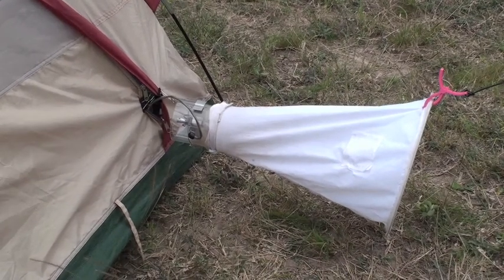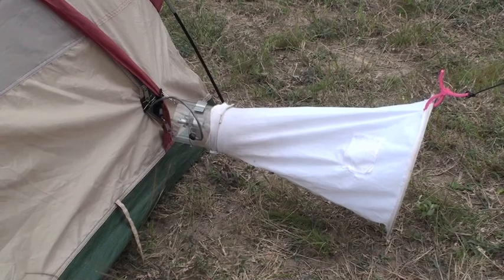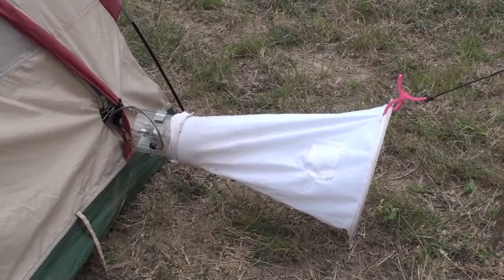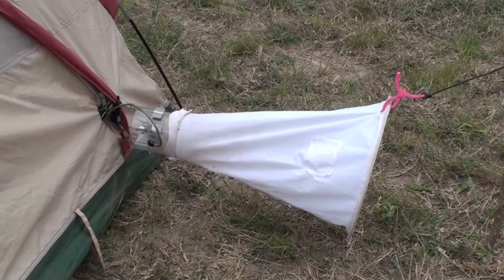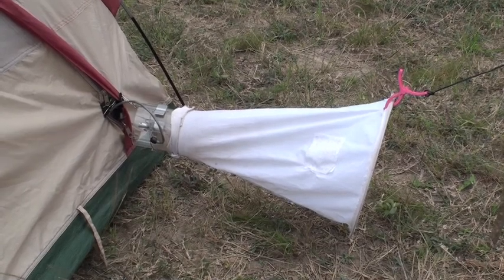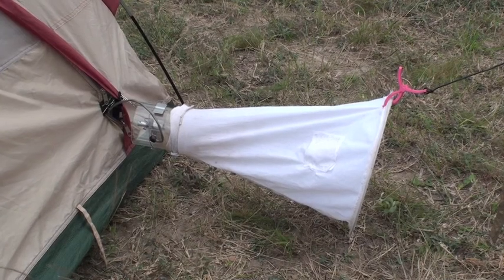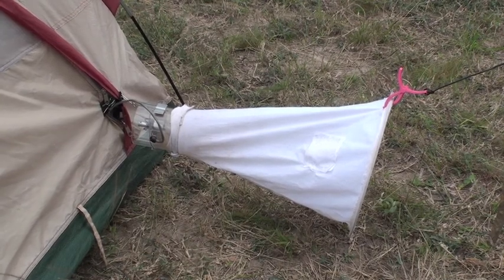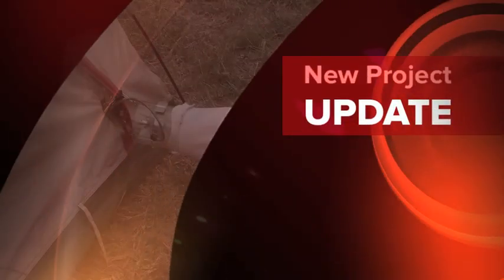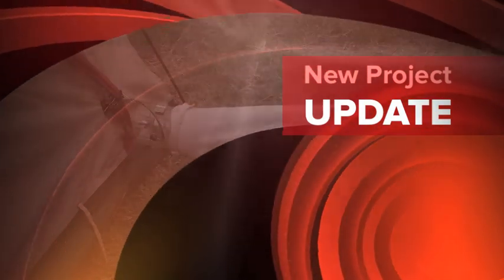The collection bag, other than being linked to the trap by the trap body, is only attached to the ground via this one wire or string. This makes it less likely that ants will come in and eat your collection. The whole trap takes less than two minutes to put up and has been known to collect more than two or three thousand mosquitoes in a night.